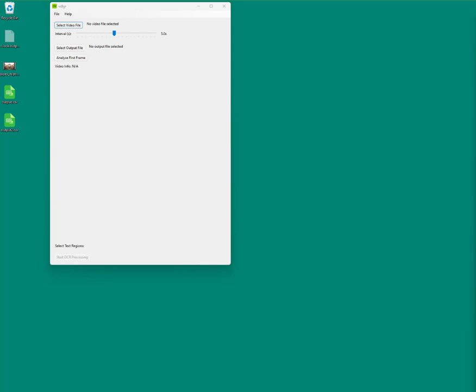If you have mixed types of data, if I, for example, have an experiment where I need to monitor temperature and mass and voltage, then that's going to be a pretty hard device to find for that specific scenario. So what I've often ended up doing is you kind of have to make your own one. But the idea of this app is a substitute for making your own custom data logger.